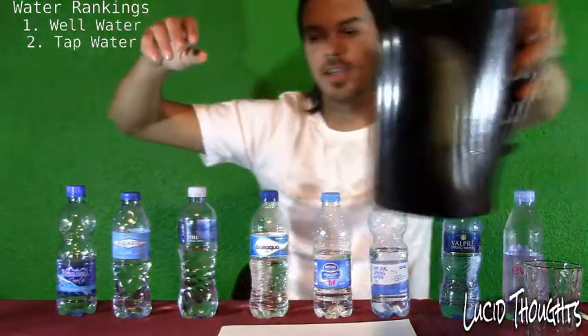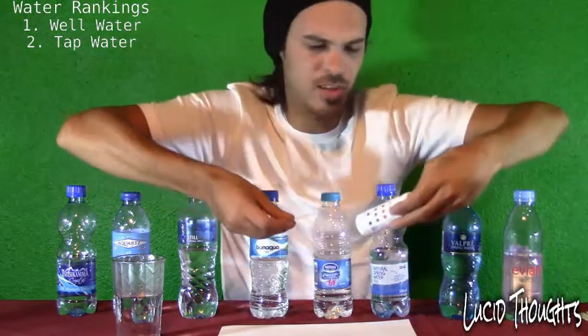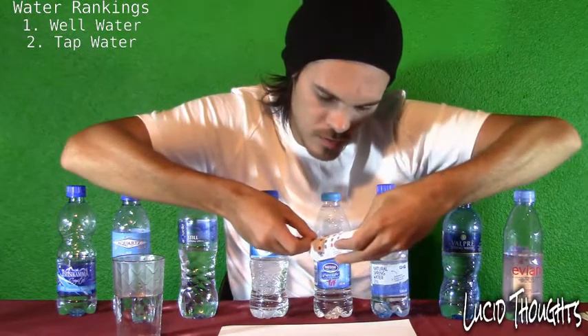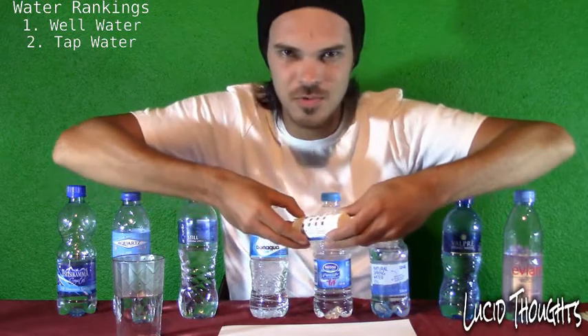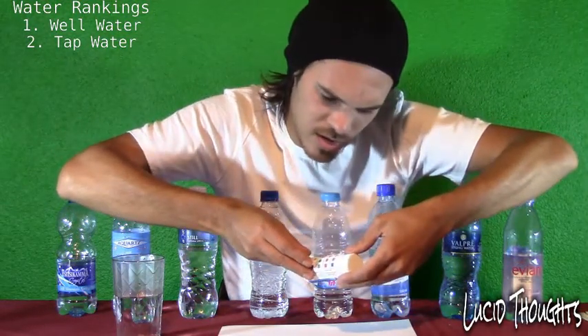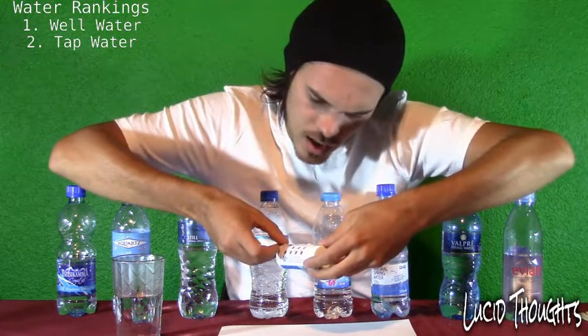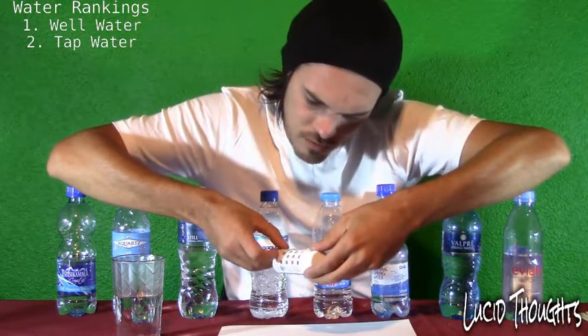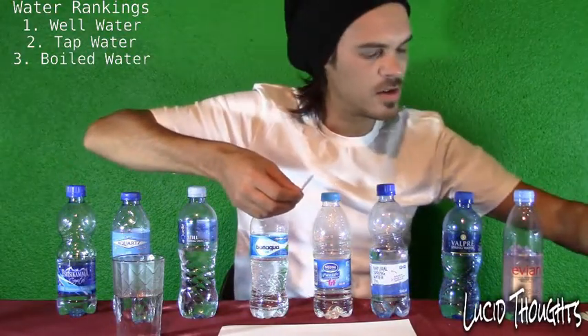Now let's test the boiled water and see the difference from normal tap water. The chlorine is basically the same, about 0.1. The pH level is also more or less the same — about 7, fairly ideal. The alkaline stays at 20 as well, so boiling doesn't really make a big difference.